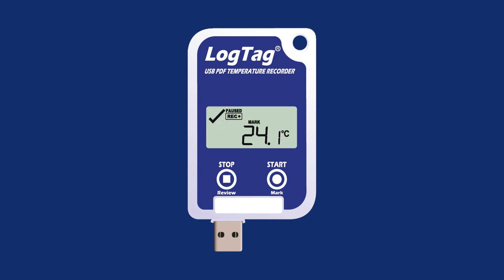During logging, if the Start Mark button has been pressed, the mark symbol will appear and remain until the next reading is taken. The next reading taken will be identified in the downloaded data with an inspection mark.